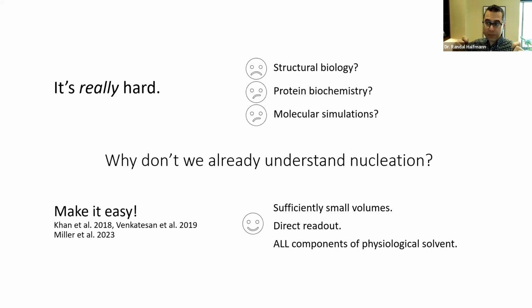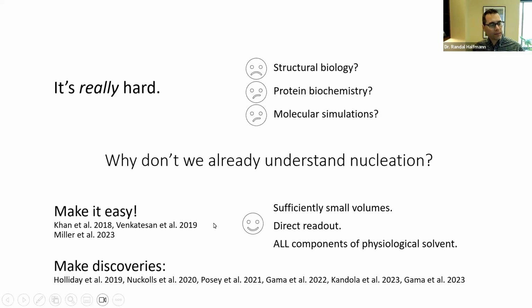And it's a simple readout so that we can actually do this across biological systems and use the same assay for the same protein in human cells, yeast cells, bacterial cells, what have you, right? So that's very important. Okay.